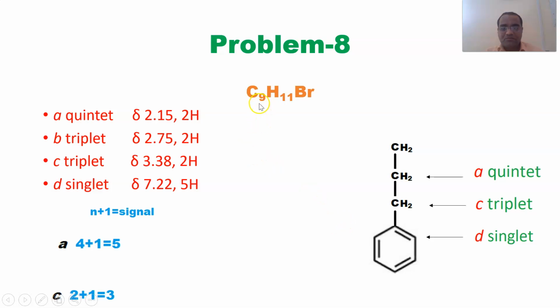Now coming towards the molecular formula, and one more signal that has been remaining till now, that is nothing but a triplet. So triplet means the adjacent has 2. So this can fit over here. The adjacent has 2, so now it can give a triplet.